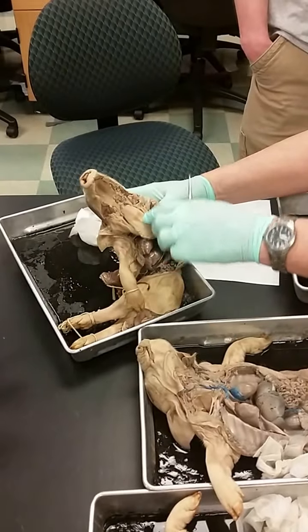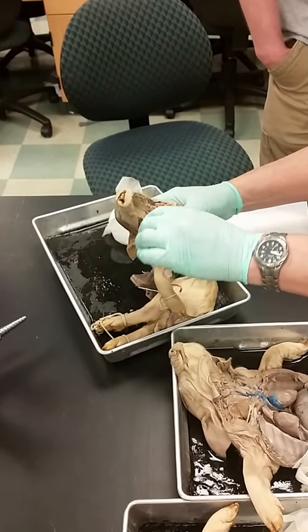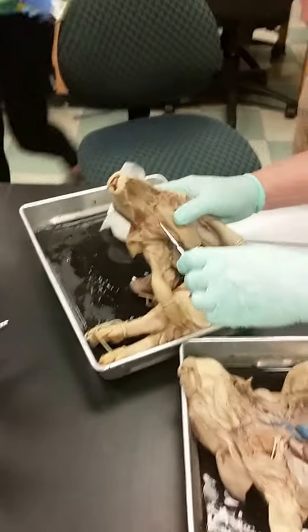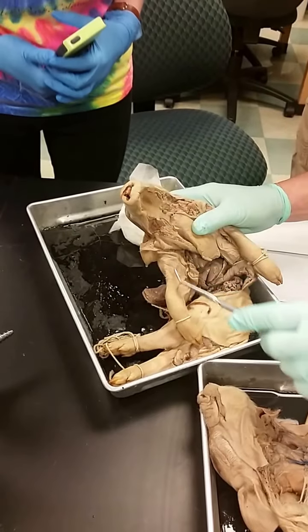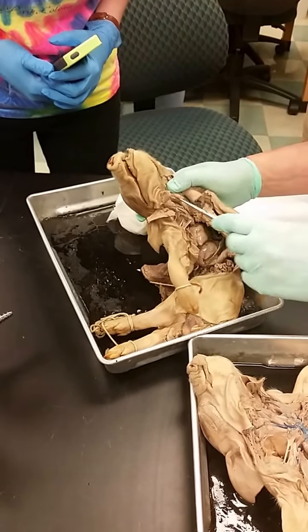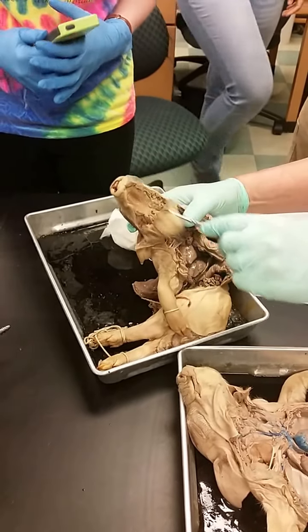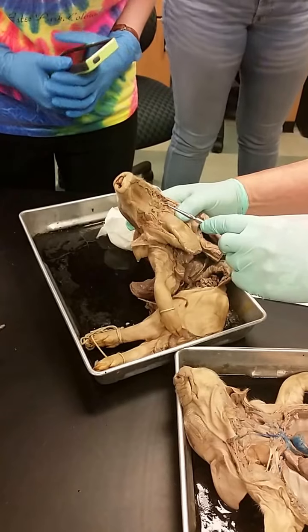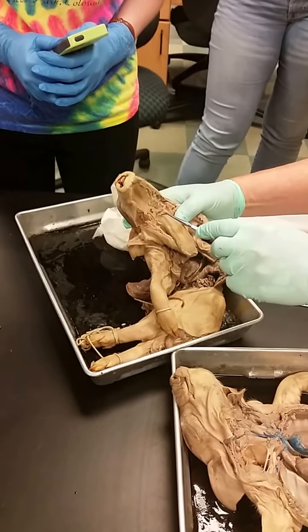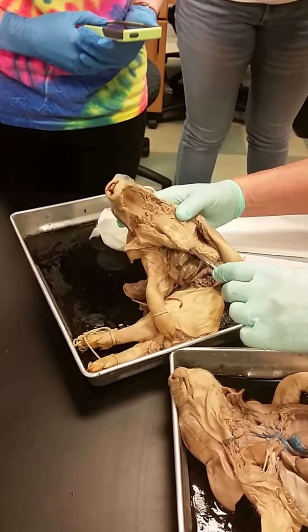By the way, this one has had its mouth cut open, and you see that structure right there? See that? That sits right on top of the larynx. So what is that? That's the epiglottis. It looks like a little curled tongue-like structure, but that's what it looks like.